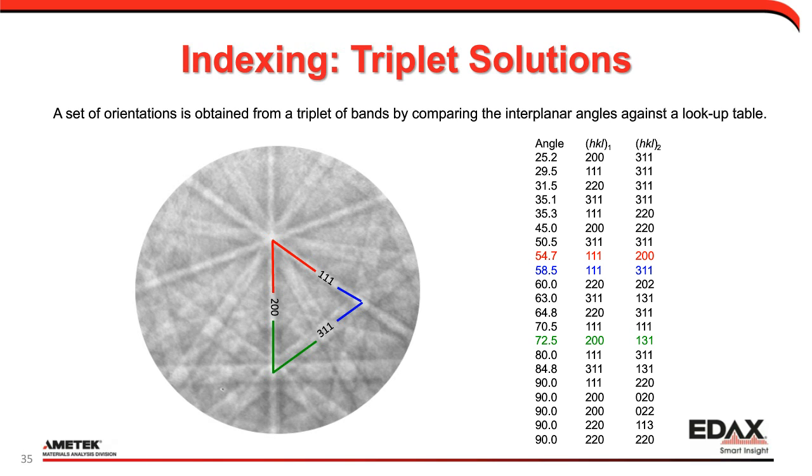planes are spatially oriented, we can then represent that orientation either as a set of Euler angles or as an orientation matrix or in HKL UVW type notation. Basically, we know the crystal orientation once we know the band positions, and that's all done by letting us know what the sample tilt is, what the detector geometry is, and where these planes are. Then there's some matrix math that occurs to determine that orientation.